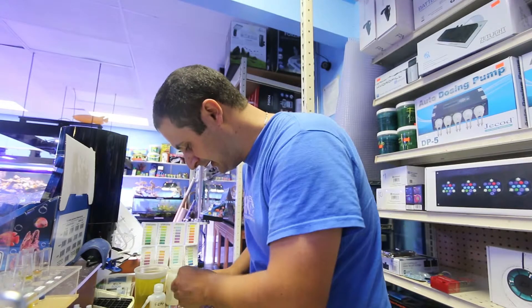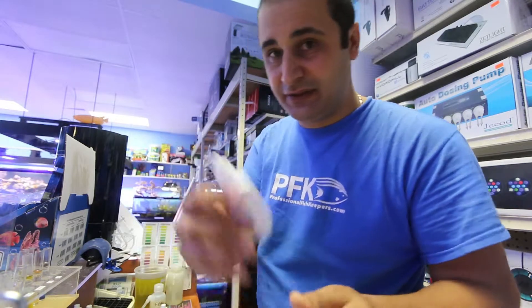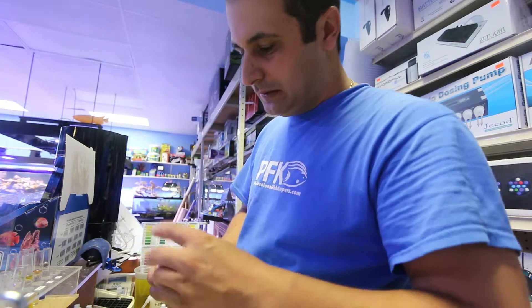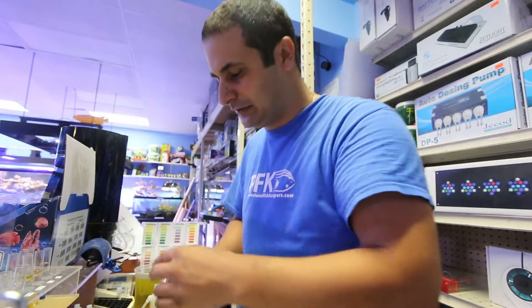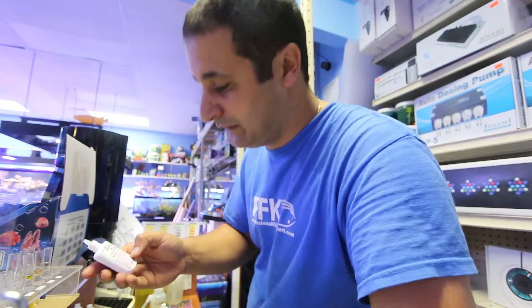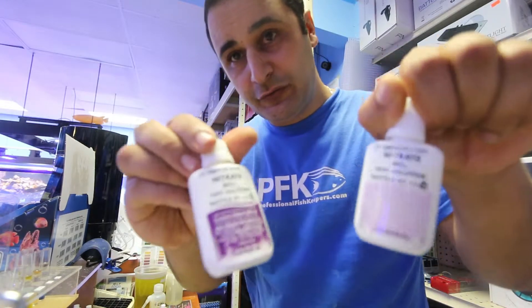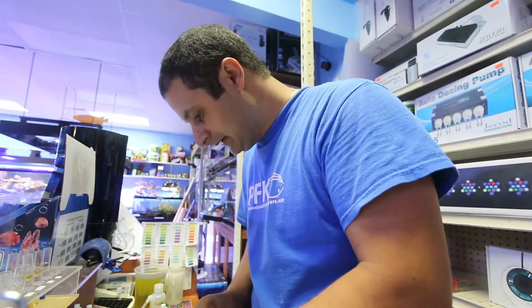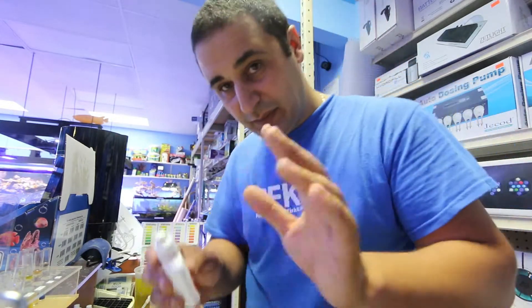Shake the bottle really well, then follow the recommended wait times. What I do is start with the test that takes the longest — nitrate — but if you want to avoid confusing which compound converts into what, start in order: ammonia, nitrite, then nitrate. For pH, you add five drops.